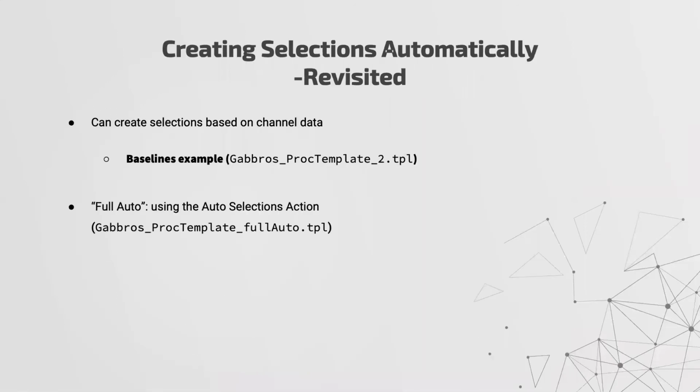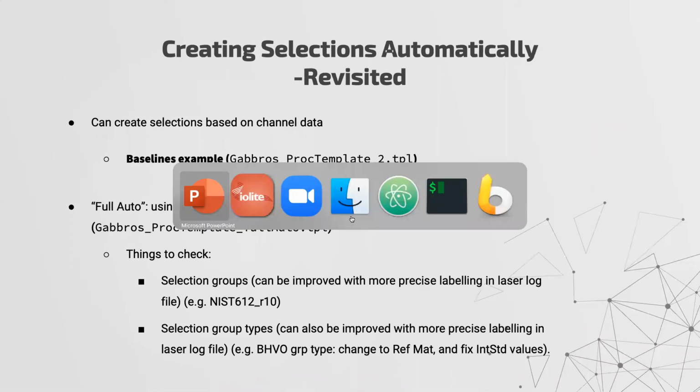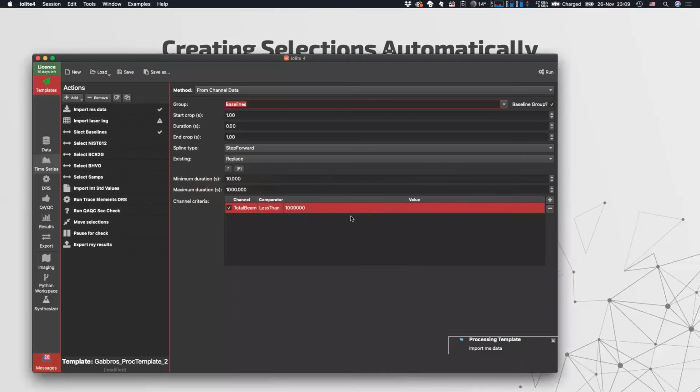Before that, I did say I'd show you what happens when we go full auto with this. And I'll give you a spoiler alert: there's a few problems with it, and I'll explain those as well.